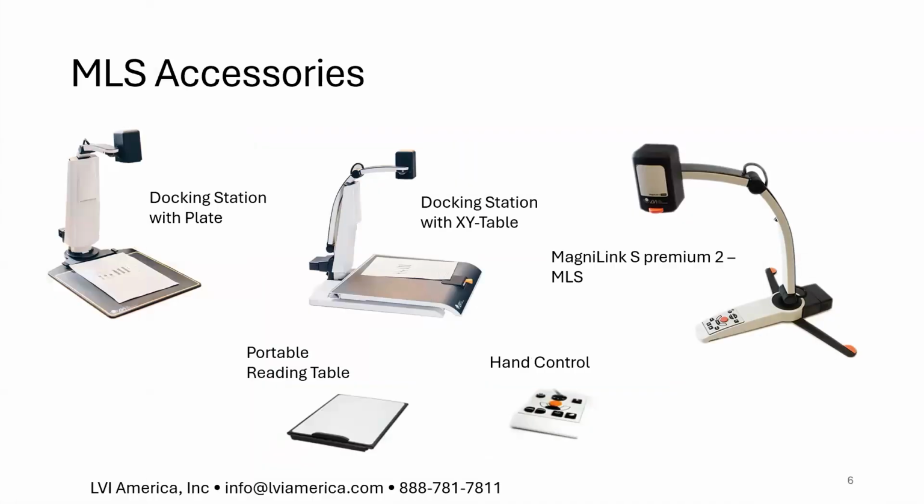The next slide does show the different docking stations. We do feature the one with the plate again. I mentioned it's got a plate like an actual zip plate. The one in the middle is the docking station with XY table. That's probably our most popular docking station that we offer.